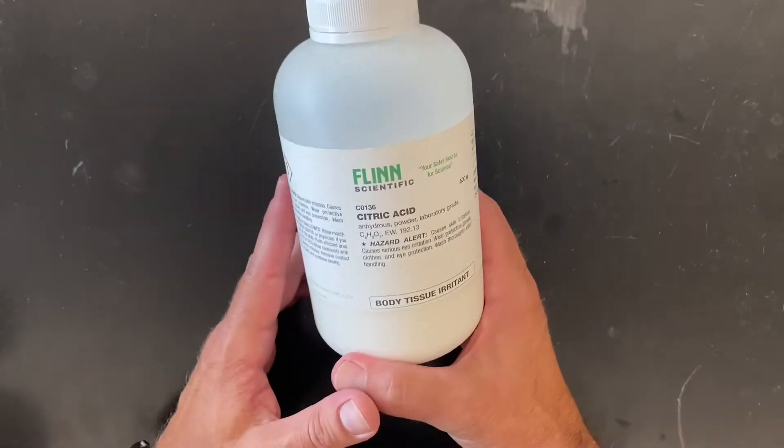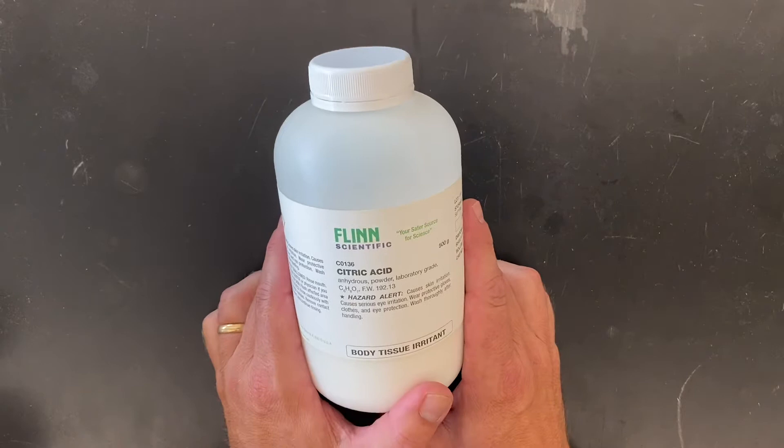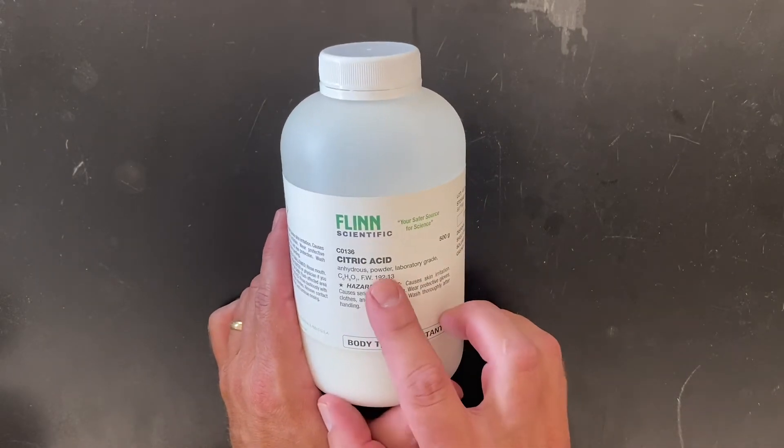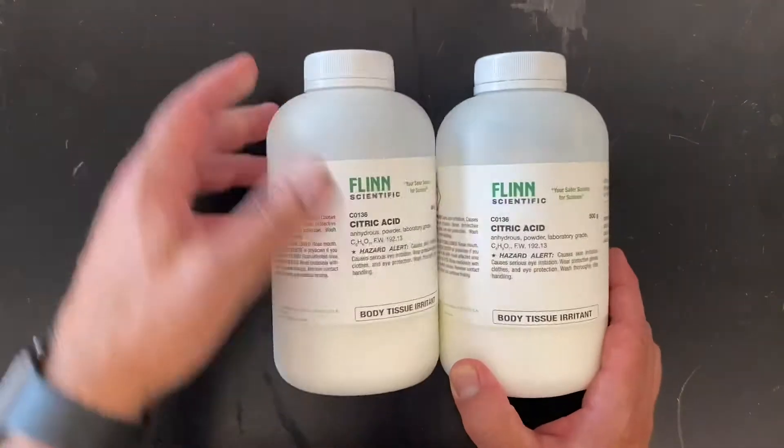In this batch of chemicals we got a couple of solid acids. A lot of people are surprised to learn that many acids are actually solids instead of liquids. Here we have some citric acid — we have two bottles of that.